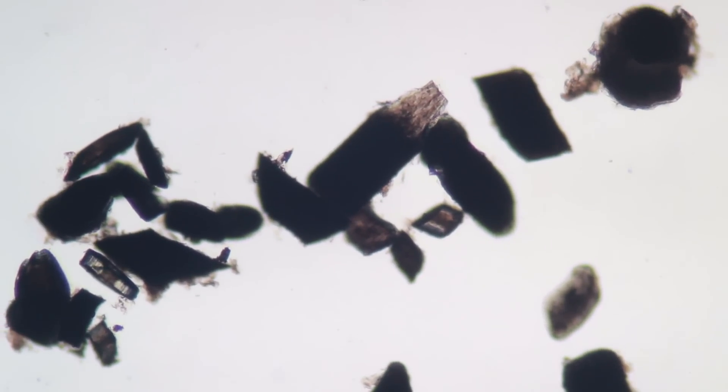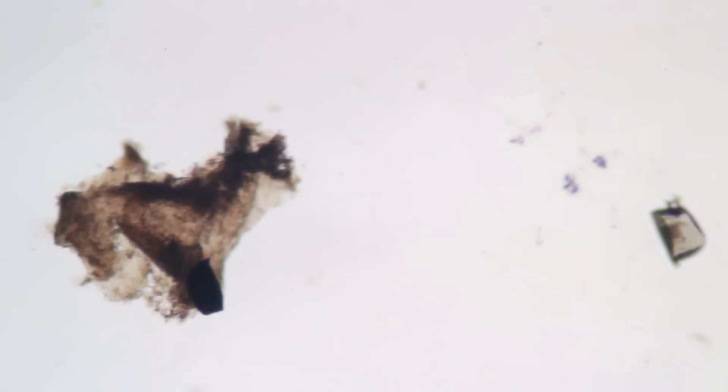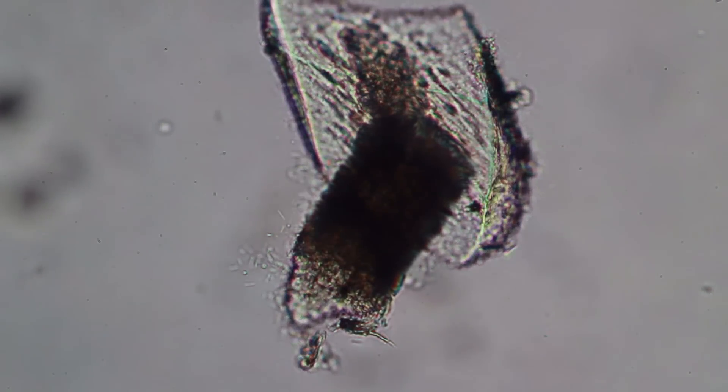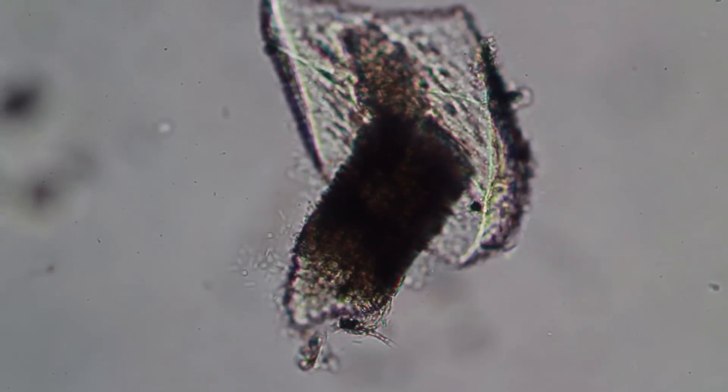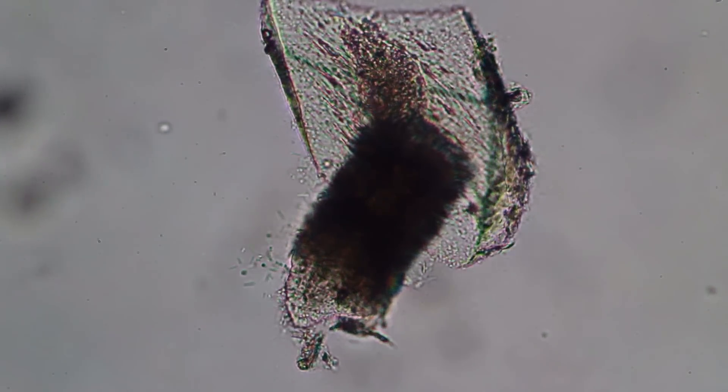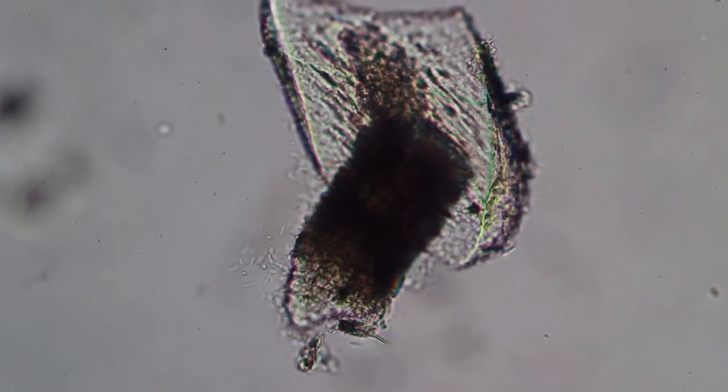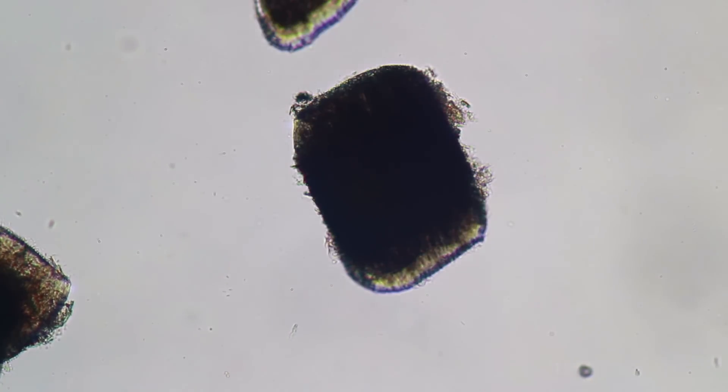I saw the little pieces of beard floating around. This is a piece of skin and you can see there is still a little bit of hair growing out of the skin. I was happy and lucky to find this: flat transparent skin with a short piece of hair sticking out.